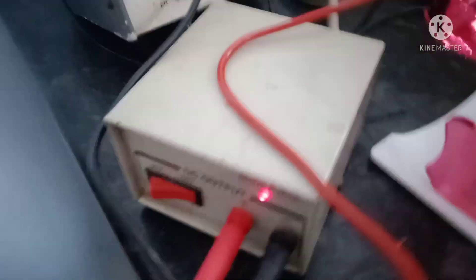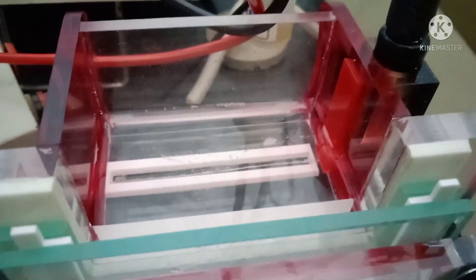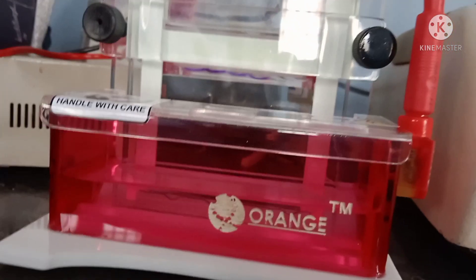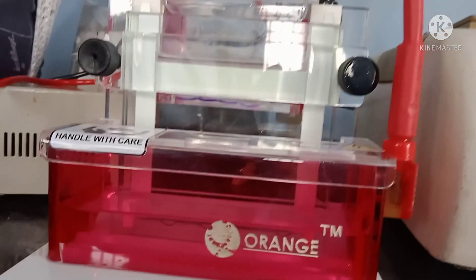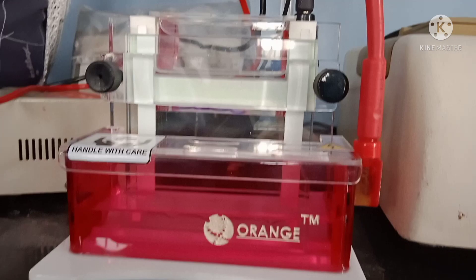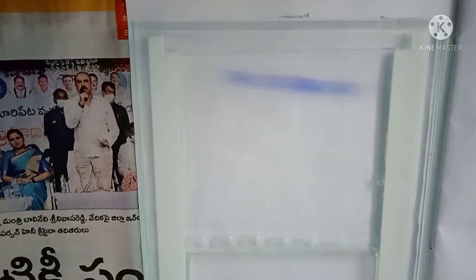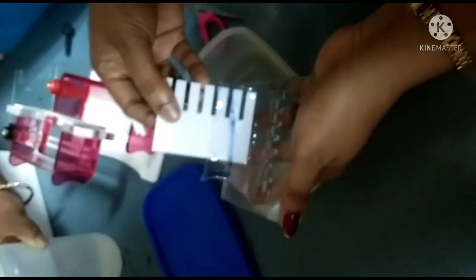Connect the electrophoresis unit to the power pack, fixing cathode to cathode and anode to anode. The samples are placed towards the cathode because proteins carry a negative charge and will migrate towards the positive electrode (anode), causing the bands to separate. When the dye front reaches 0.5 cm above the bottom of the gel, turn off the power. At this point, proteins of different molecular weights have been separated.